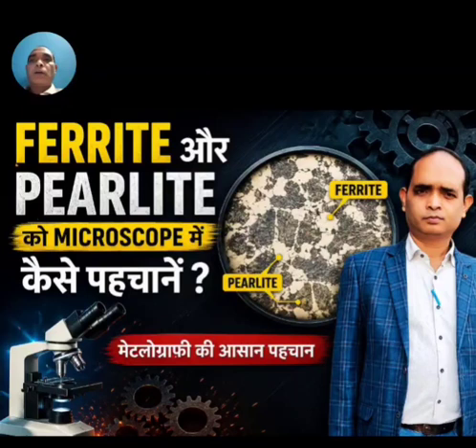Today's topic is how to identify ferrite and pearlite microstructure under an optical microscope. By the end of this lesson, you will understand what ferrite is, what pearlite is, how ferrite and pearlite are formed, how to identify them under a microscope, why they are important in steels, and common mistakes students make during identification. Steel is one of the most widely used engineering materials in the world.